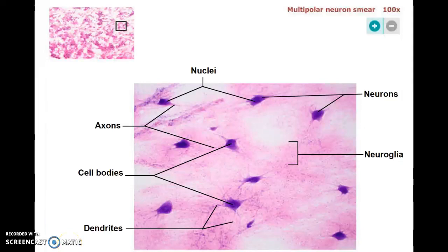Anatomy and physiology students, this is a review of tissue slides for the lab. Just a reminder that you definitely want to use your wish list to go along with this, so that you're only identifying the things that are actually on the wish list.